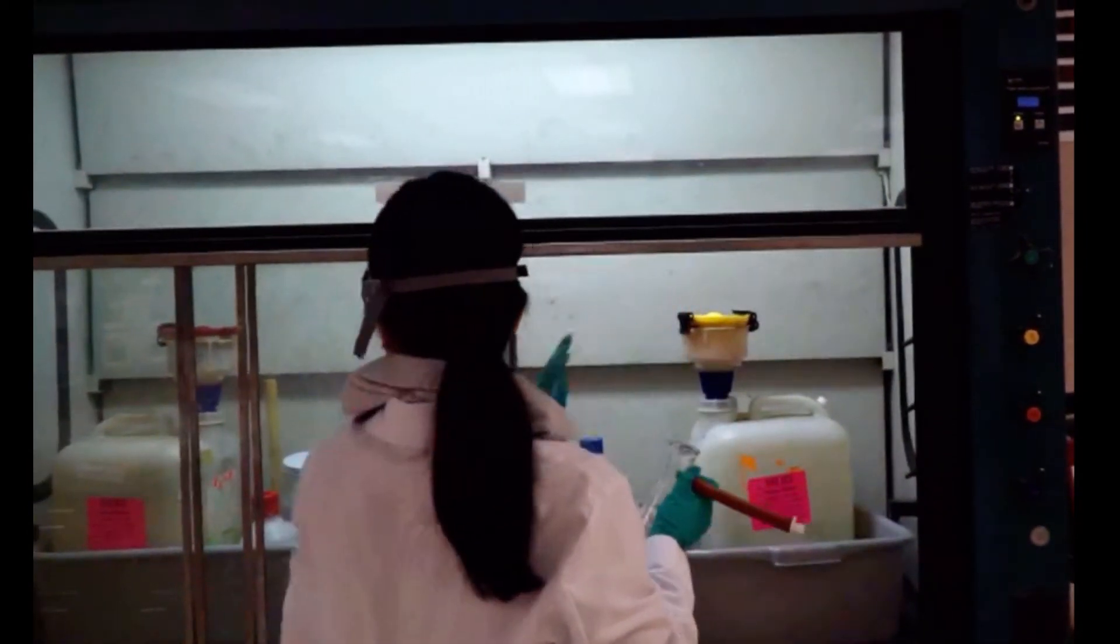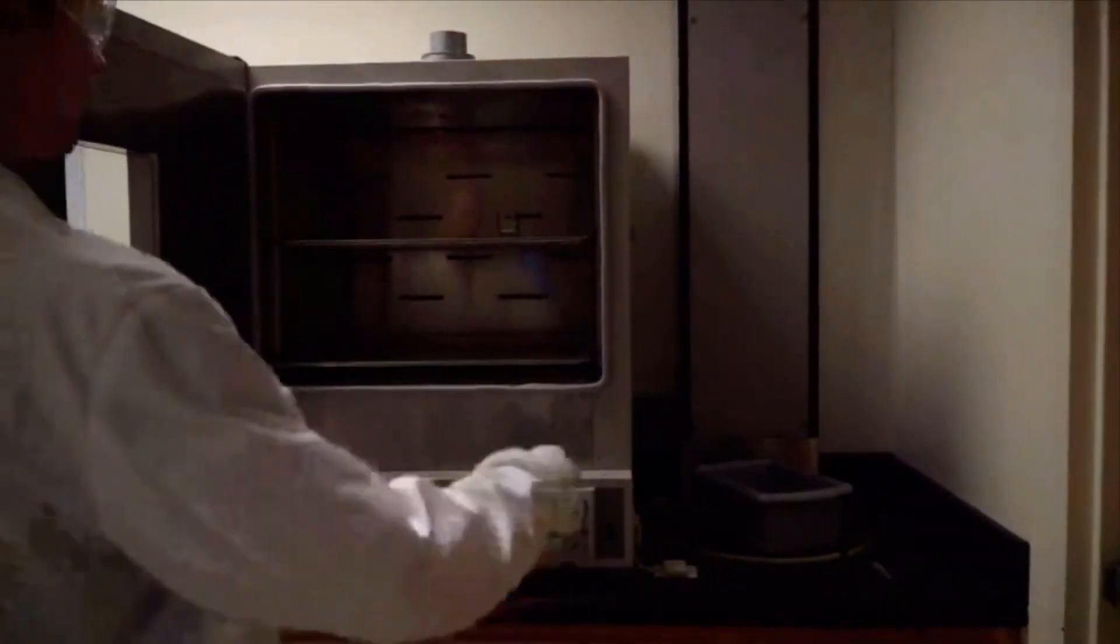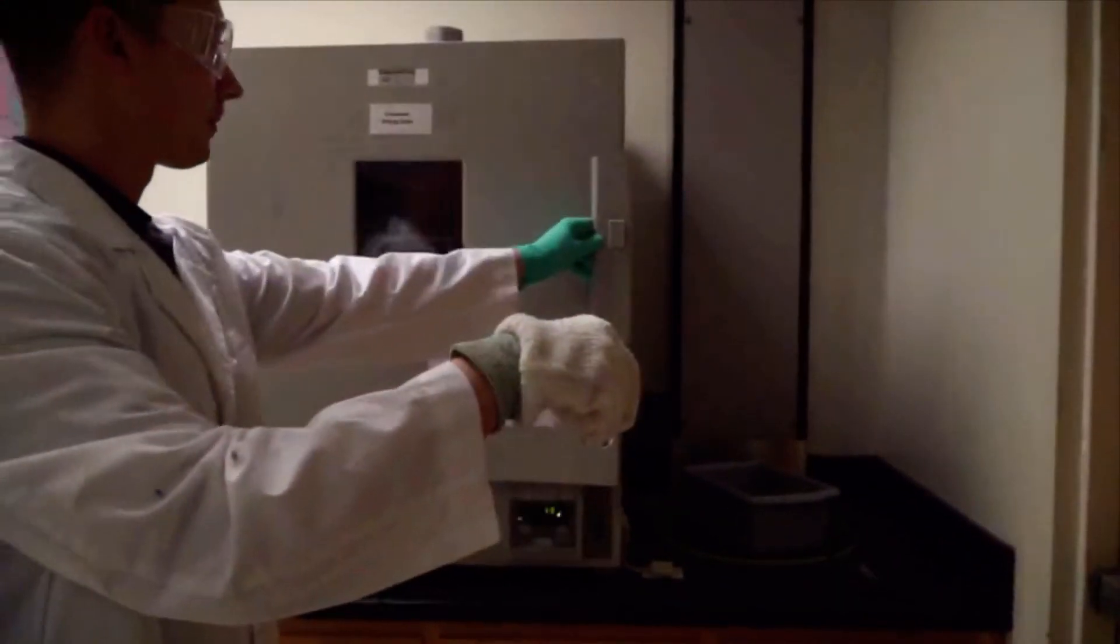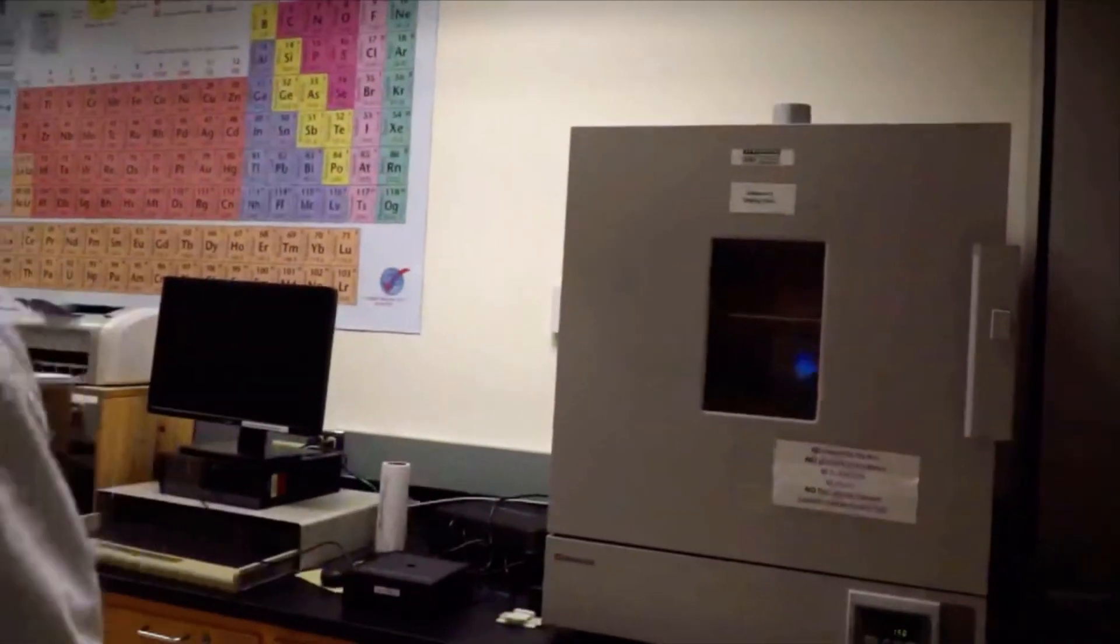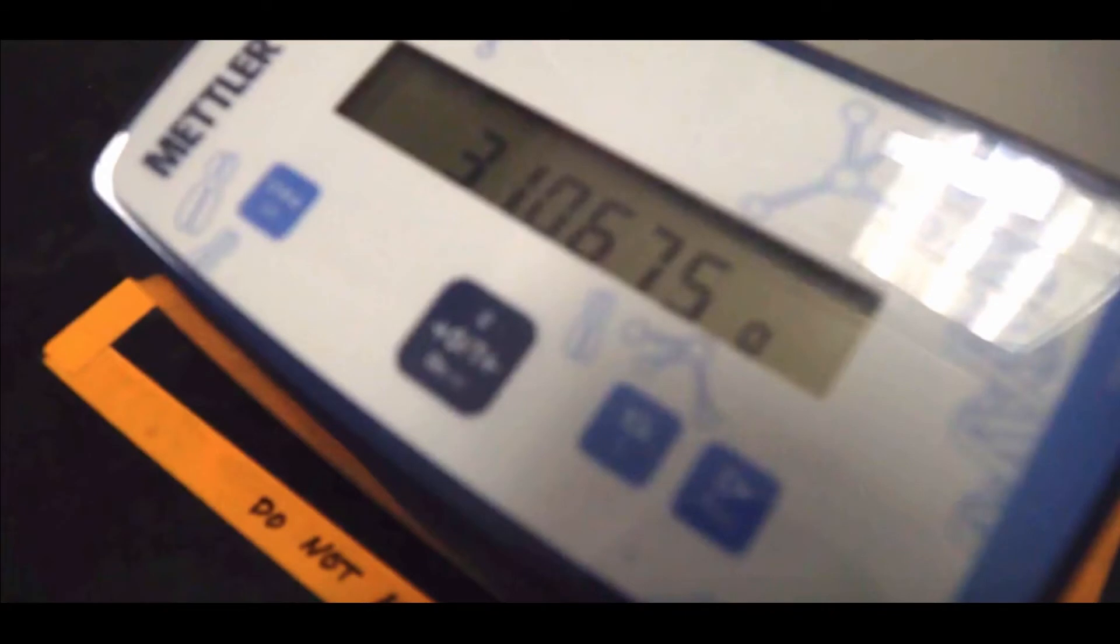In this experiment, constant mass is defined as 0.3 milligrams for two consecutive readings. Remember that temperature will affect the mass measurement, so be sure to cool your sample completely. This is an analytical balance. Always make sure that the mass readout goes to four decimal places.